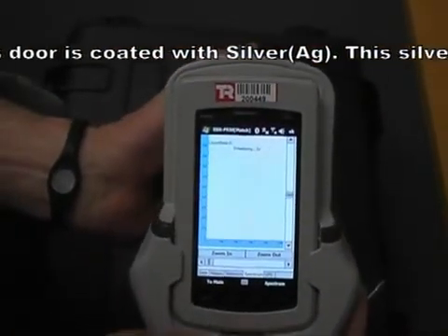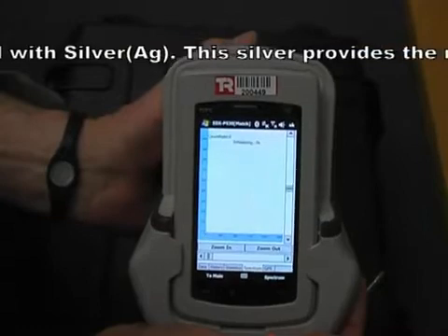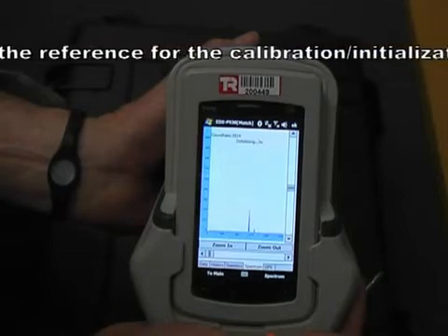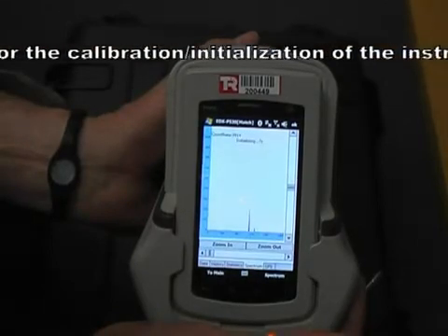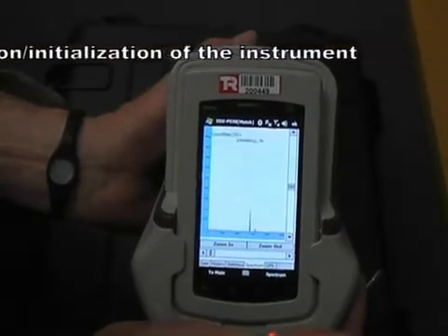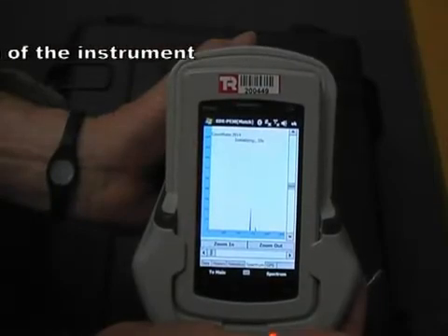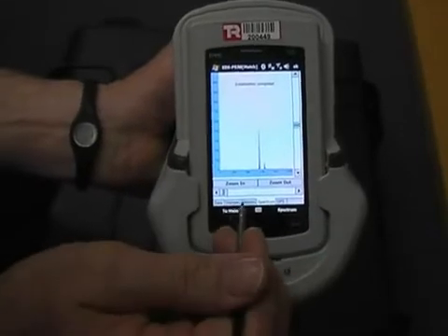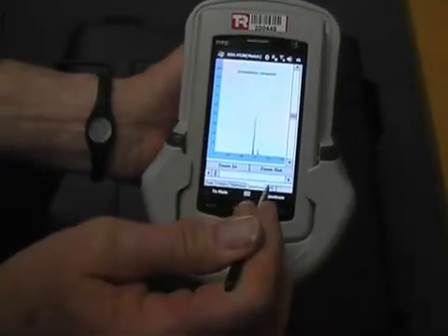The instrument is now initialising — it's testing the silver. Initialisation is complete, and we're going to return to the main menu.